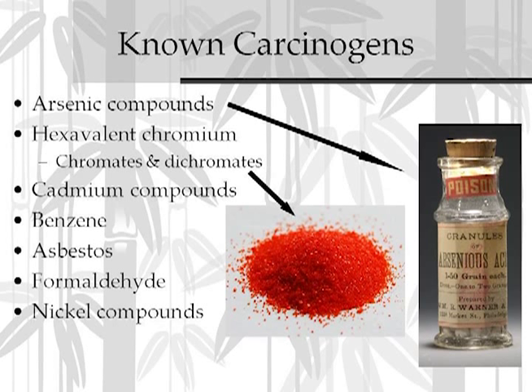Other things we see that are known carcinogens in schools, periodically we'll still find old bottles of benzene. That's very rare, and I don't know anybody that I've worked with who's using it in school. This is just a good one to get rid of it, but highly flammable, a known carcinogen. Asbestos we still find, and typically that's used in triangle heating pads that they put under the top of the Bunsen burner. There are non-asbestos alternatives for that, so those are good ones to get rid of.